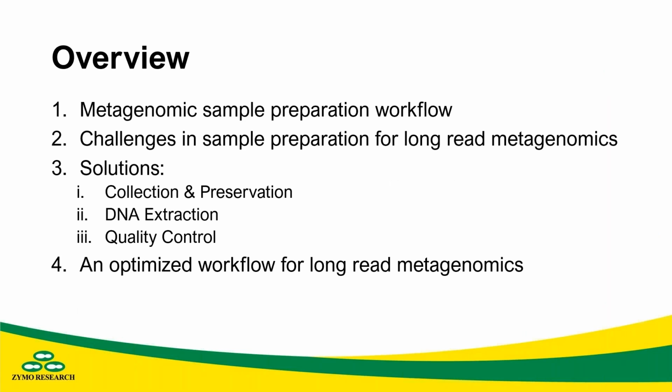Just a quick rundown of what we're going to cover in the next 10 minutes. So we'll start with an overview of the metagenomics workflow, specifically focusing on sample preparation. We'll then touch on some of the challenges and solutions here before we review an optimized workflow for long-read metagenomics.